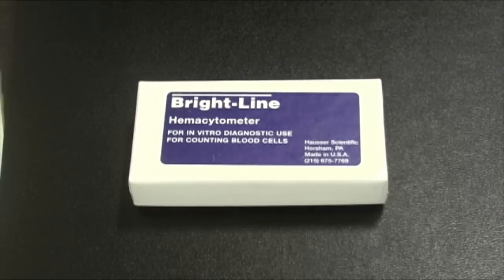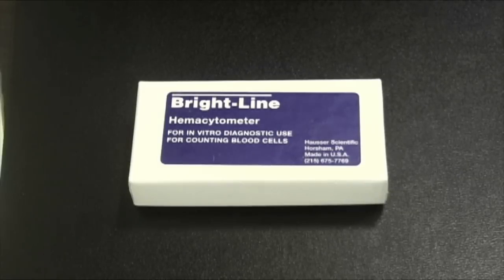In this segment, we want to look at some mechanisms of making counts under the microscope. We're going to be using what's known as a bright line hemocytometer to do some particle measurements. Now, particles can be cells or they can be actual physical particles, for instance, if you're working with microparticles to develop an assay.